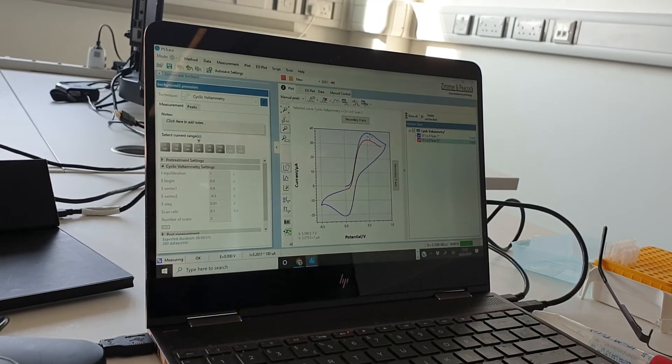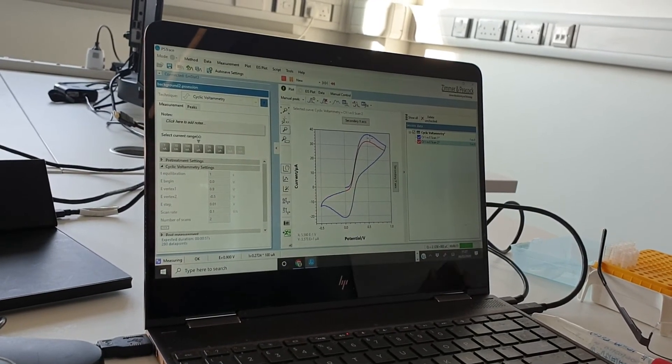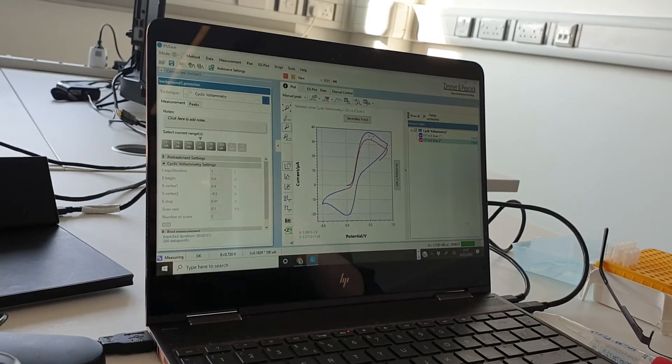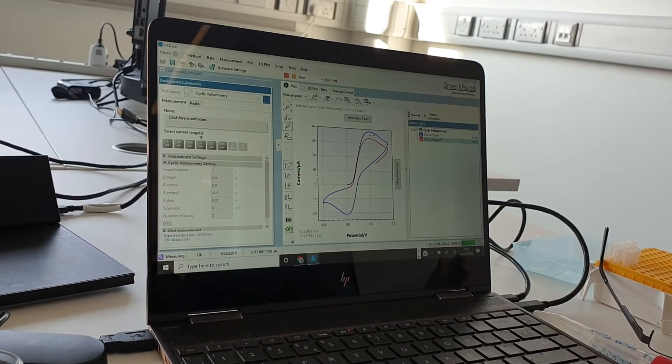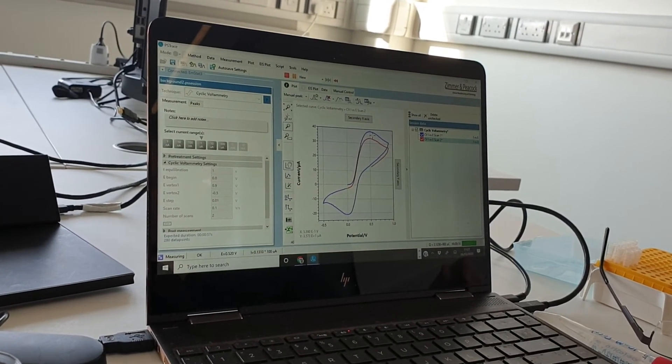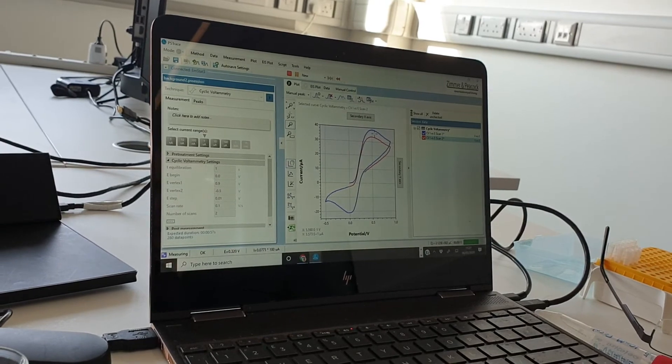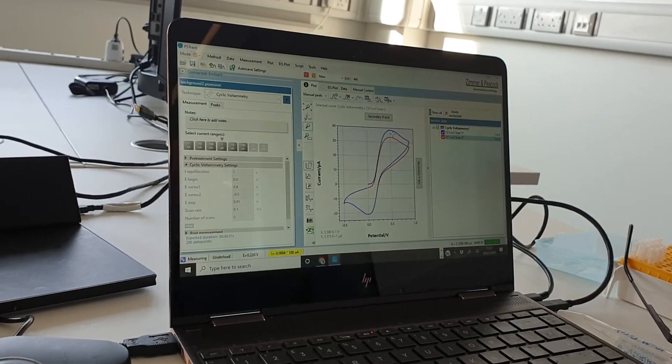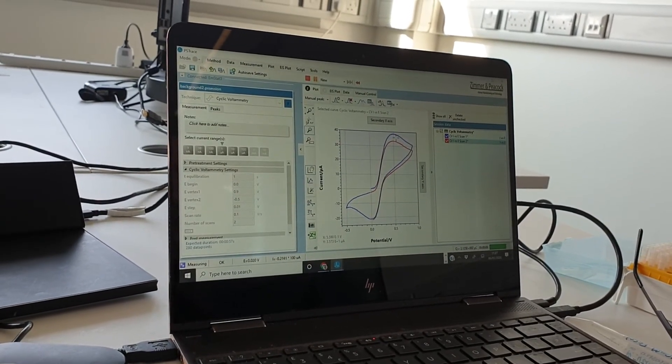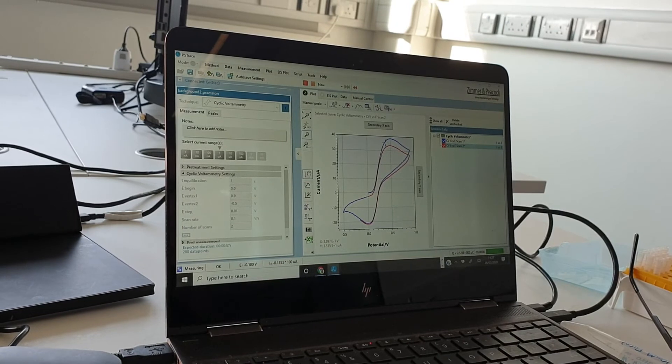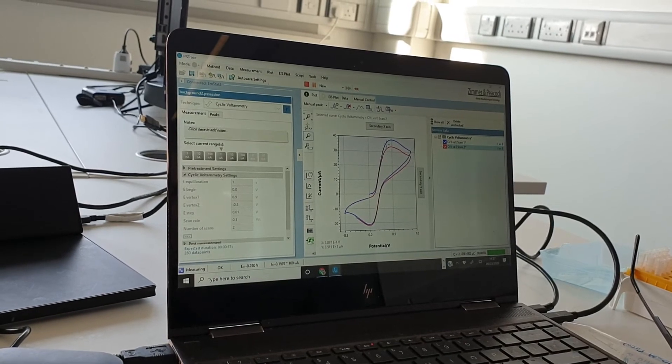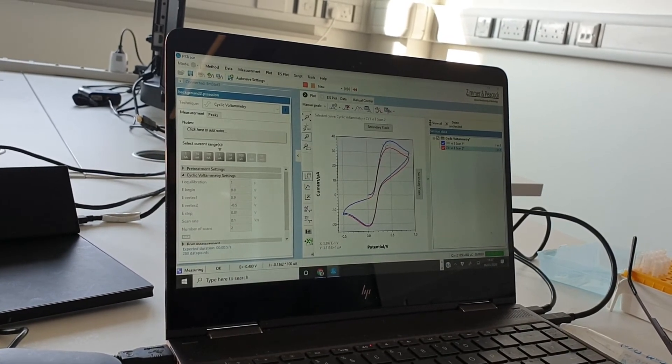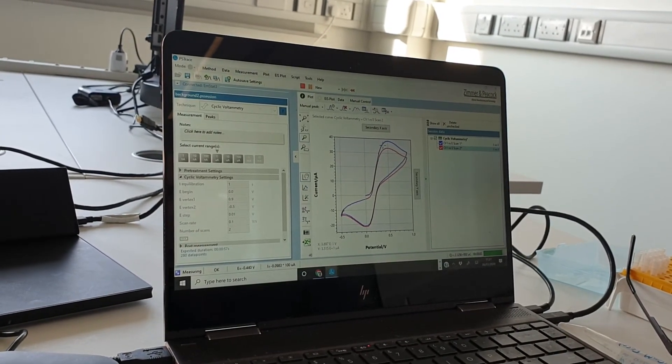And end up getting an average and standard deviation of these parameters because that would make your results more statistically significant. And then it will finish.